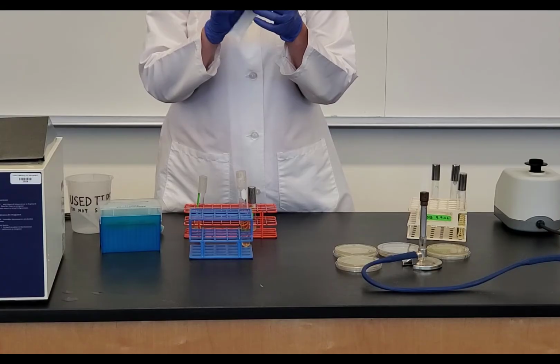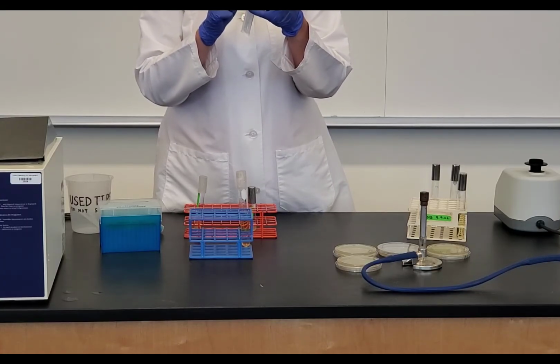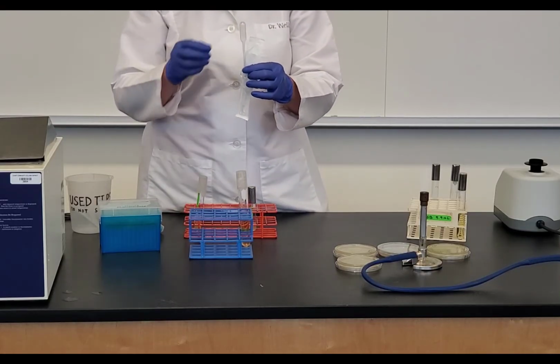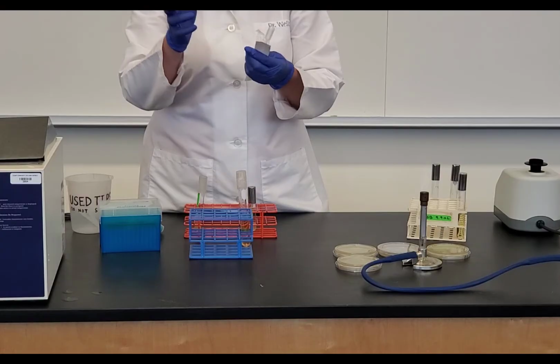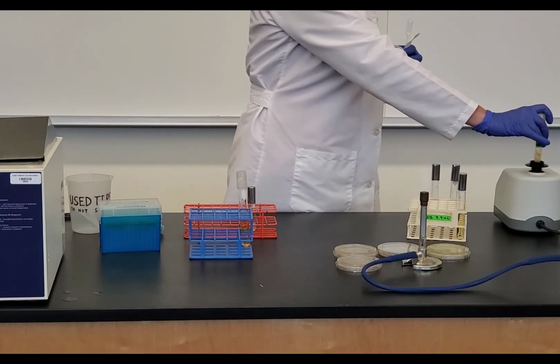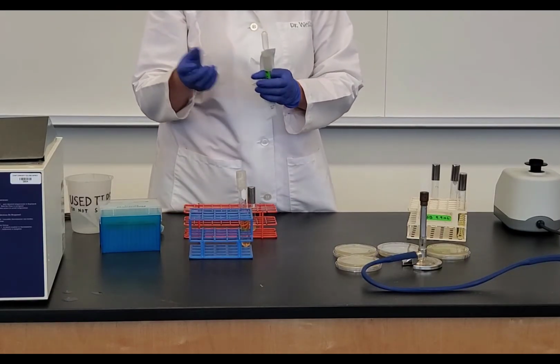On my transfer pipette, there's a 1 milliliter mark, and then partway down there's one that's 0.5. That's how much of the bacteria that I need to transfer. So I'm going to take out my transfer pipette. Before I do that, I'm going to re-vortex my E. coli because I want to mix that.